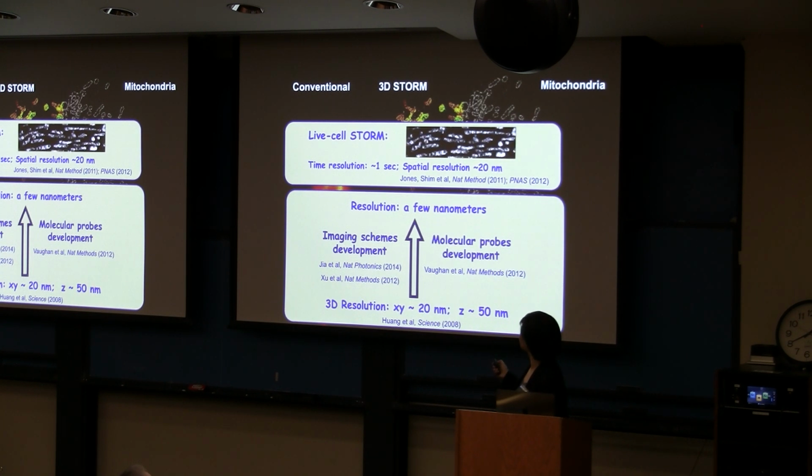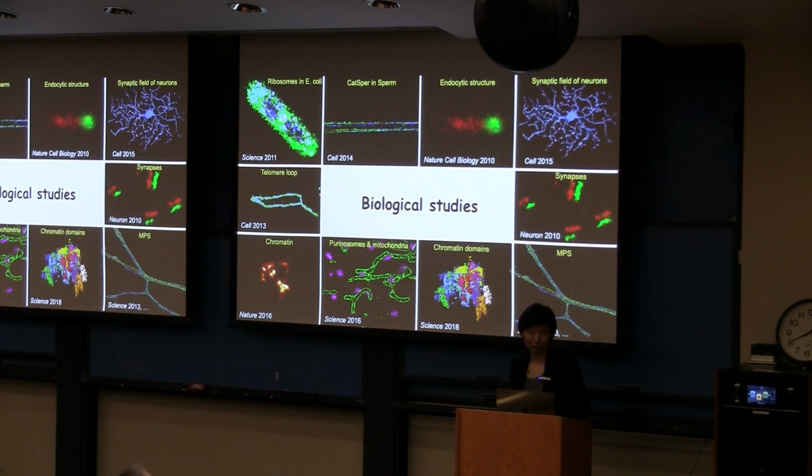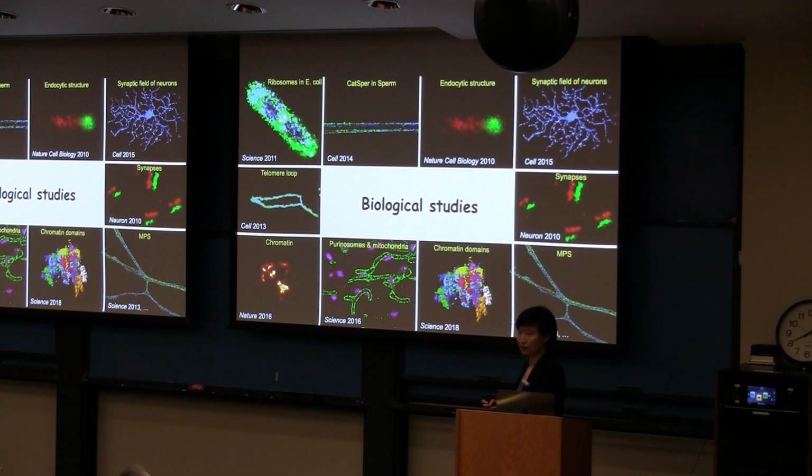But nonetheless, even in this early work, we get pretty fast temporal resolution with spatial resolution 10 times better than the diffraction limit. And then it has been improved since. So with that, let me turn to the biological discoveries.